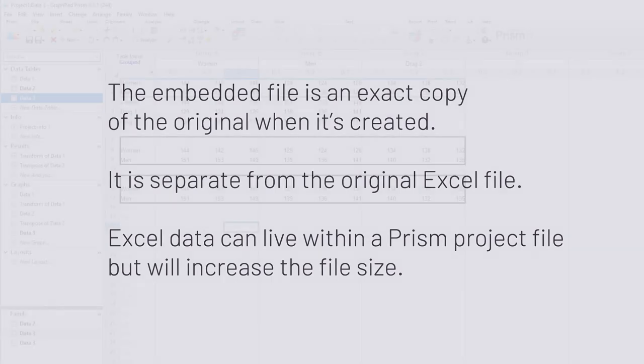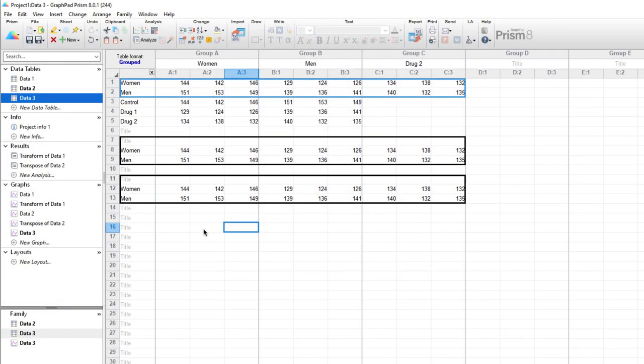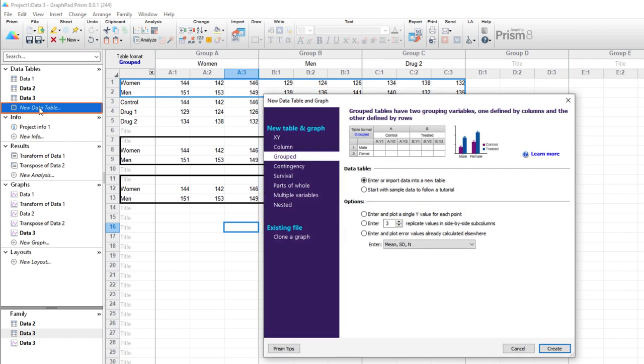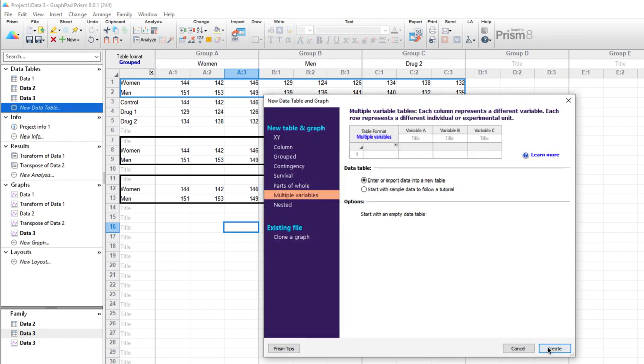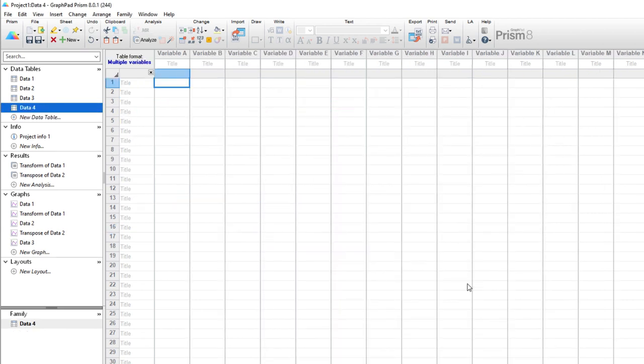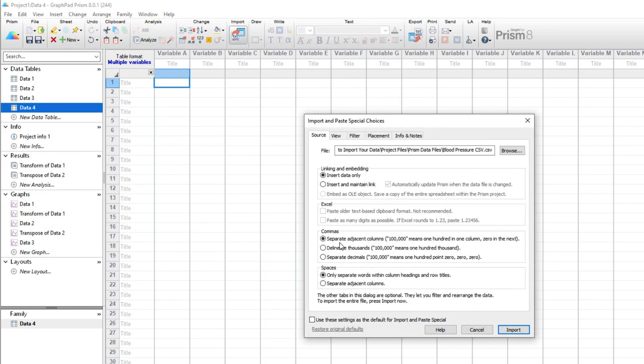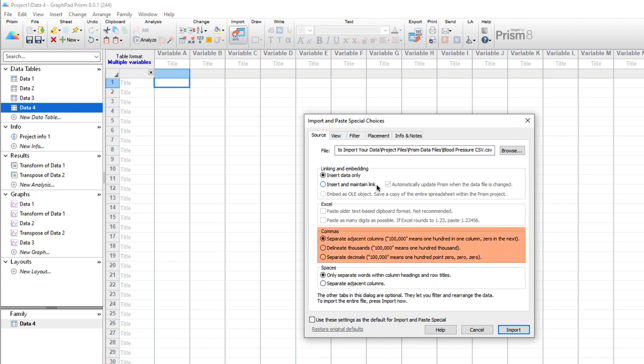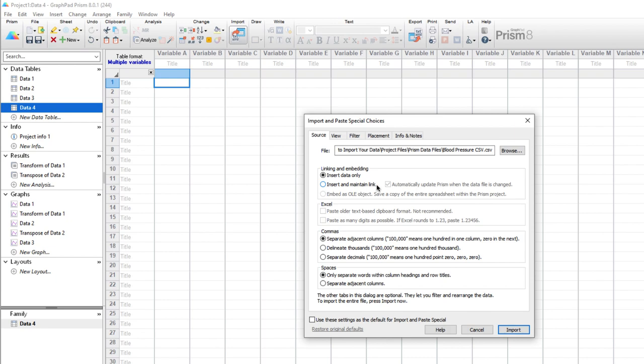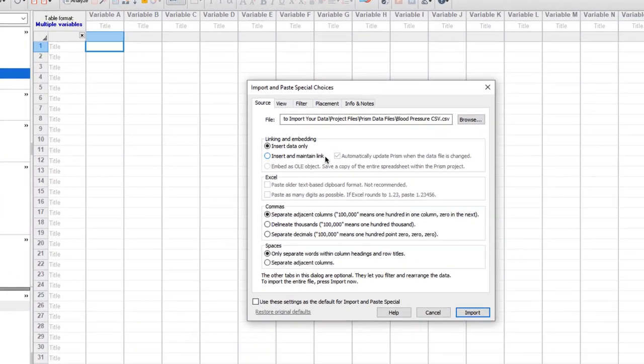Let's keep exploring some of the features of the import and paste special dialog. We'll create a new data table, we'll make it a multiple variables table, and we'll import the file bloodpressure.csv. When importing a text file, we can choose to enter only the data, or to link the data to the original text file, similar to what we just saw with Excel files. There are a number of other features on the source tab that are important to understand when importing or pasting data. Specifically, the last two sections of the tab require that you know something about the format of your data, and how commas and spaces are used.